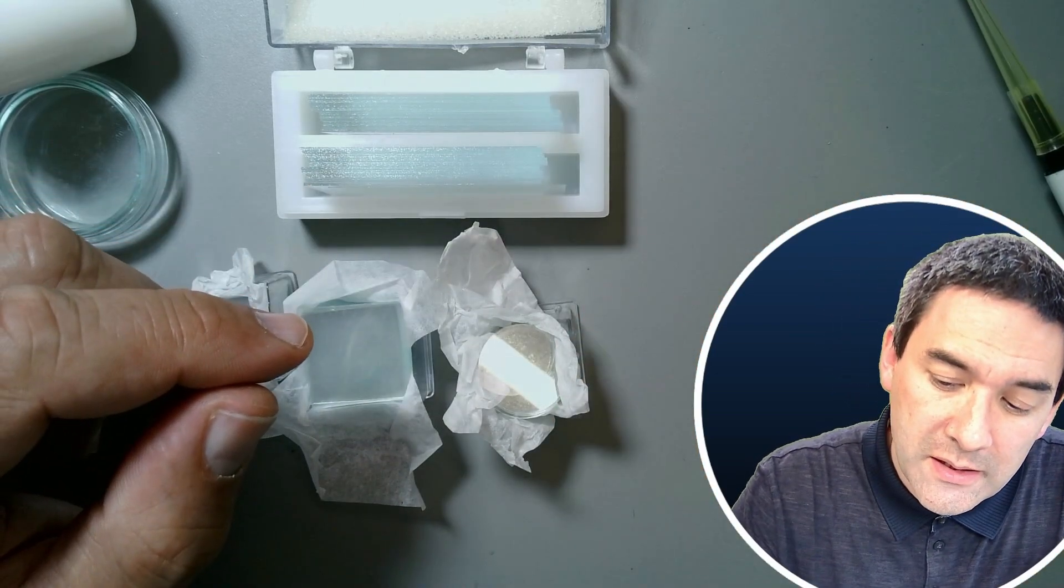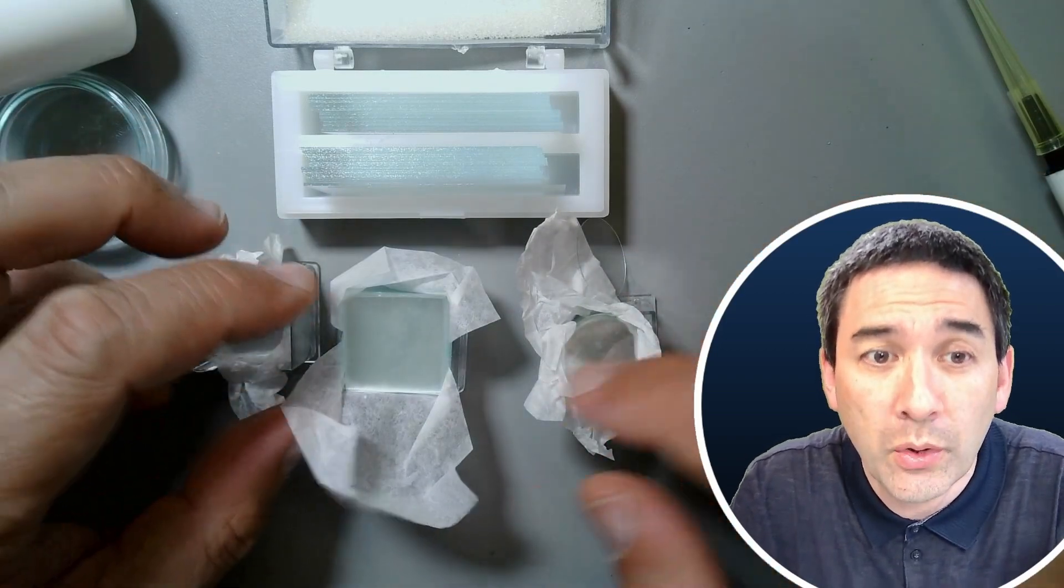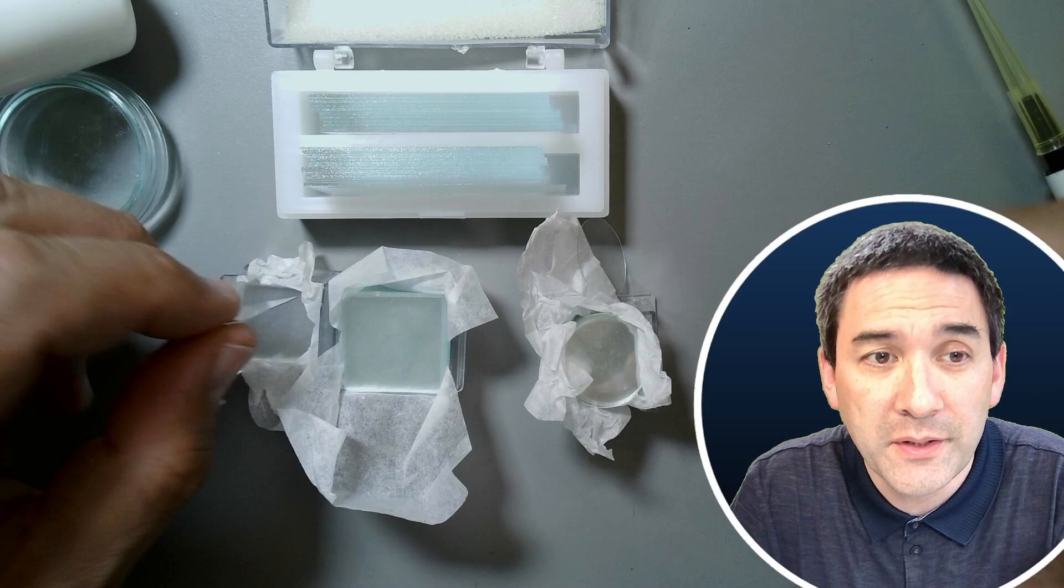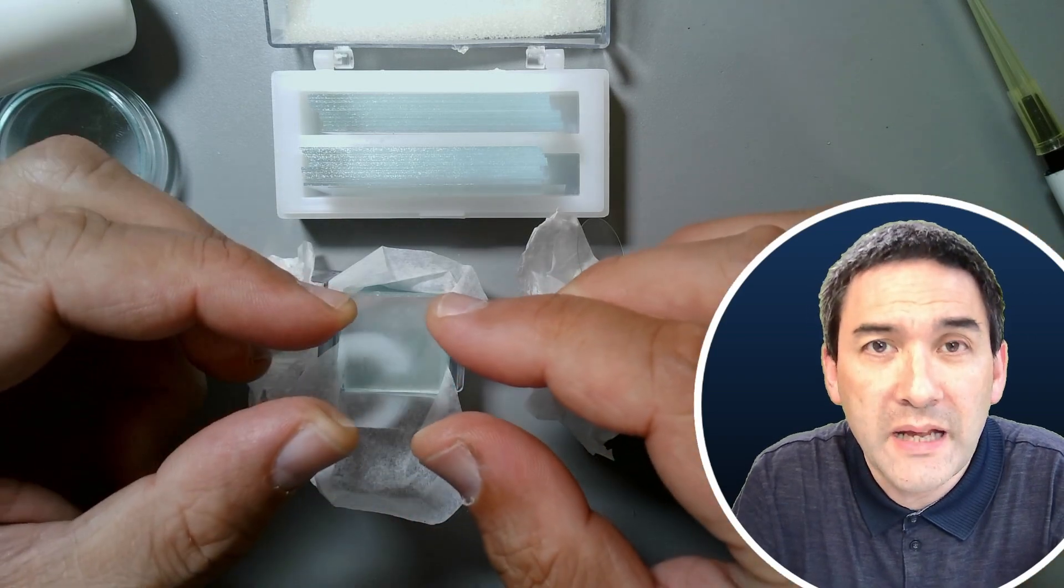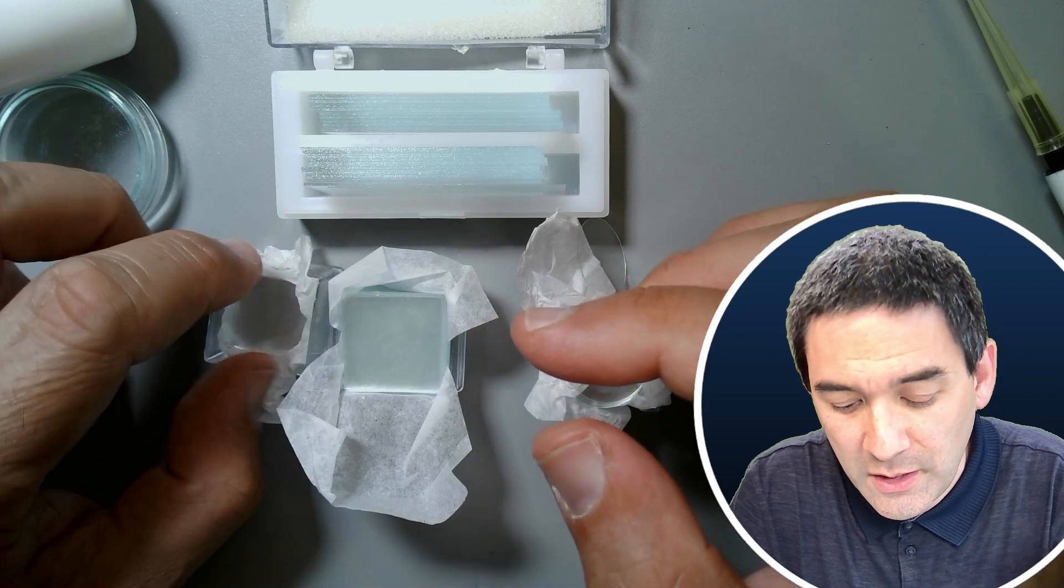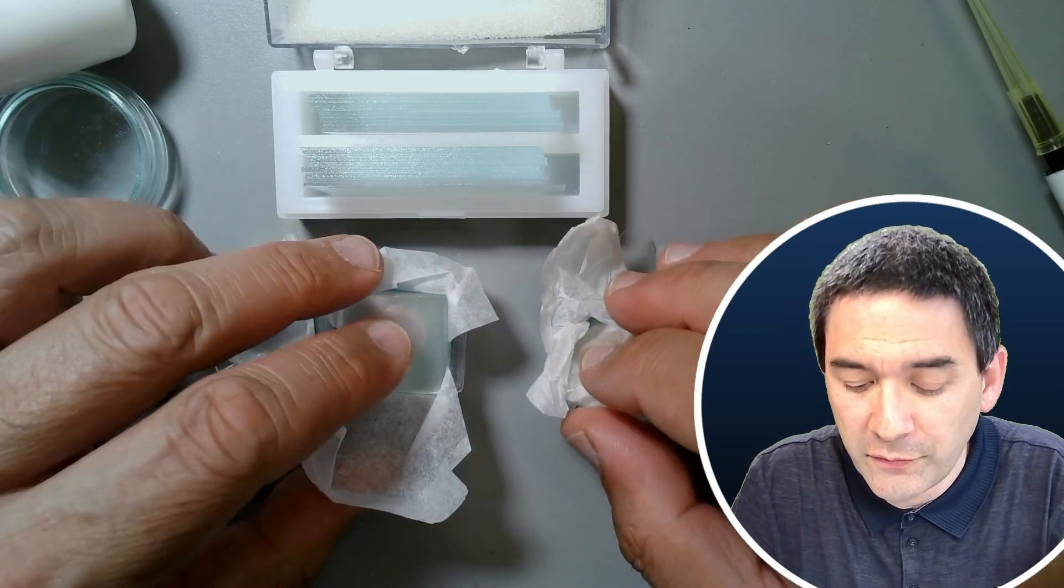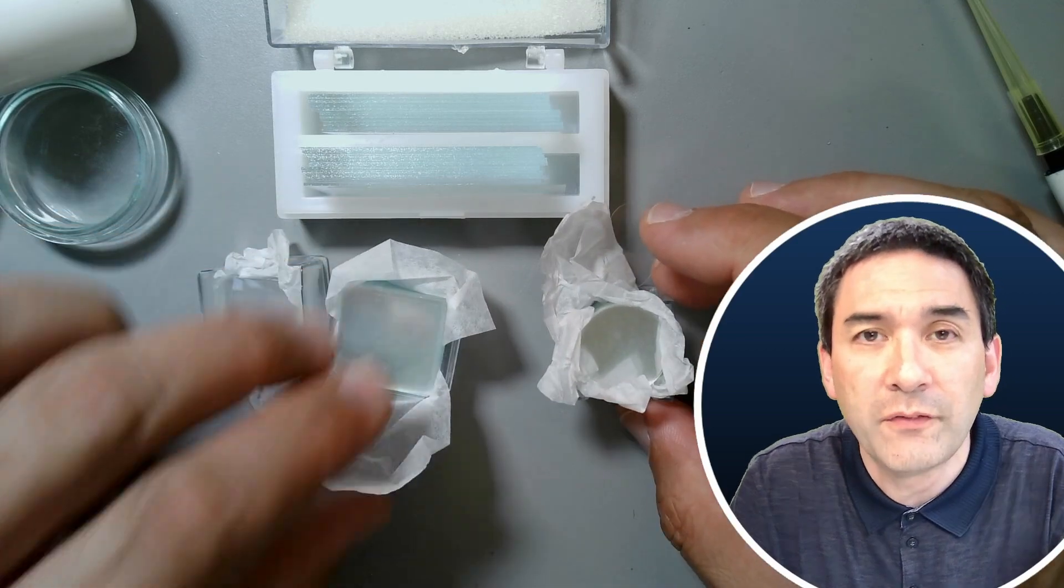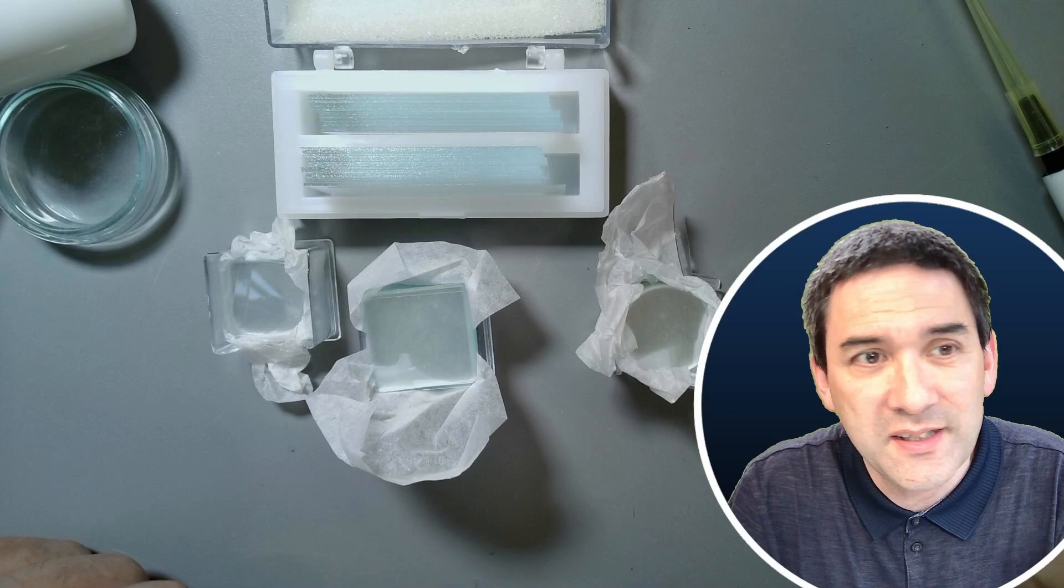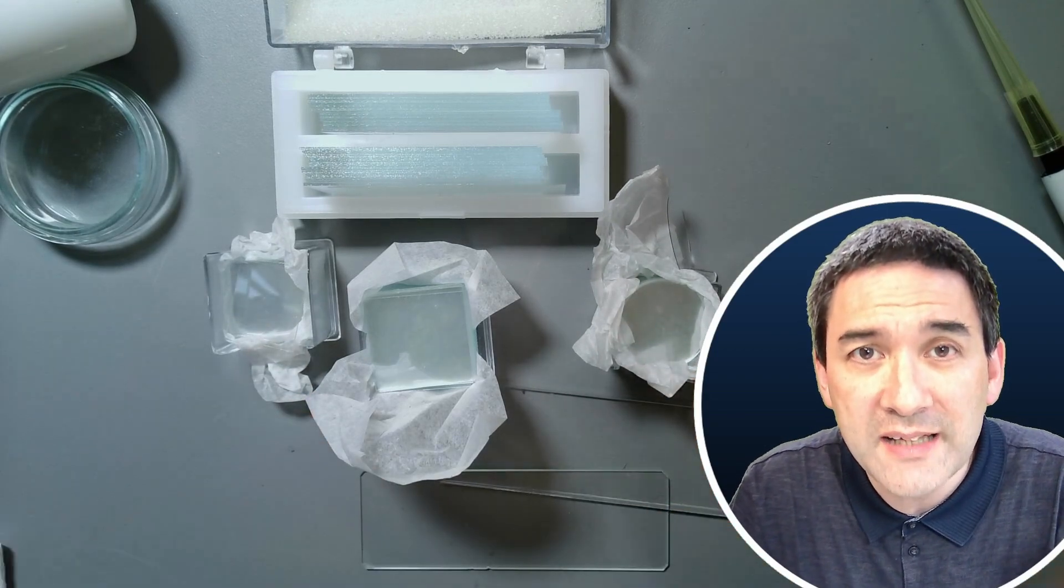That's basically the choices that you have. There are even more sizes you can choose from, but I generally recommend you use those with 18 millimeters because the smaller ones are a little more stable. Most cover glasses have a thickness of approximately 0.15 to 0.17 millimeters. That is the standard size.